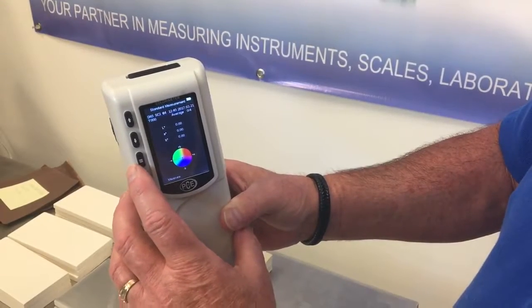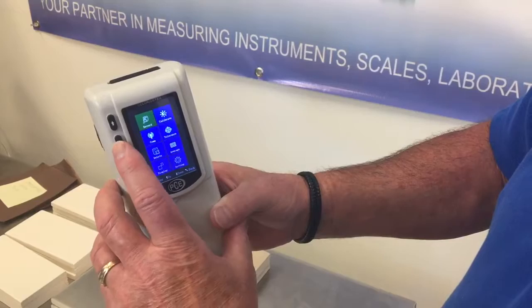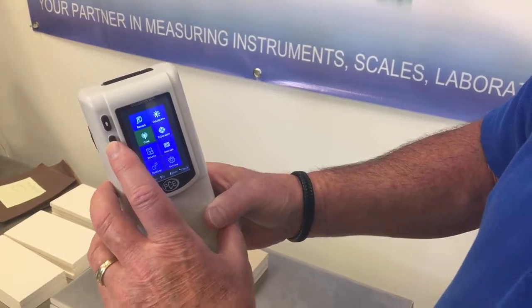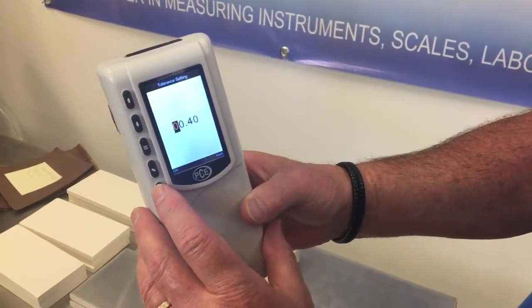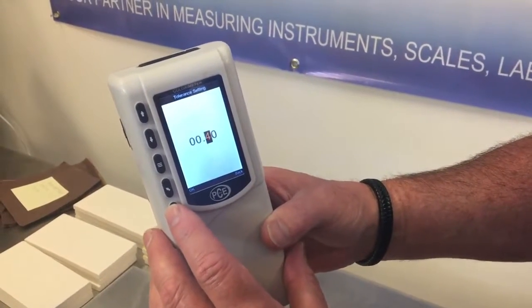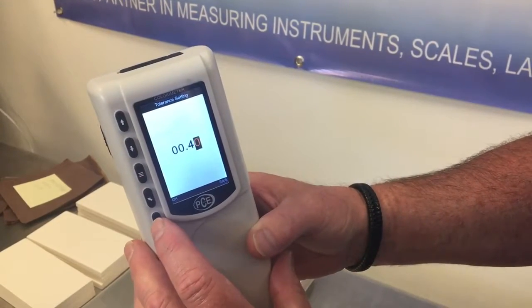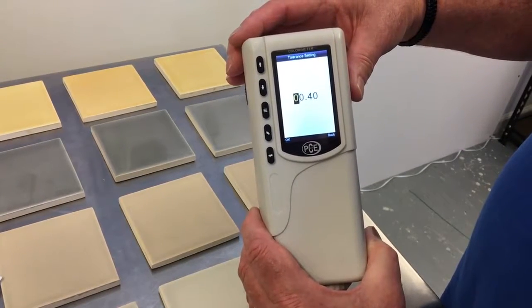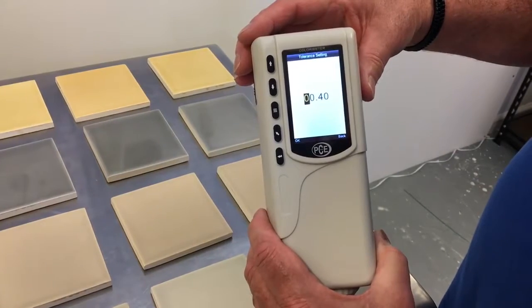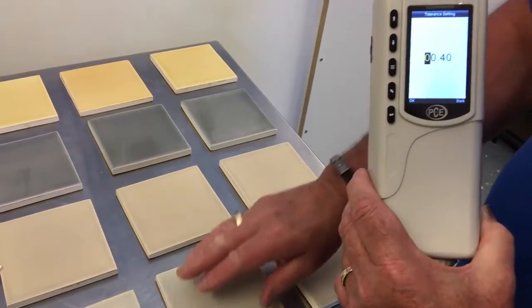Now we'll set the allowable tolerance. Go into menu, go over to tolerance. Enter. On. Zero zero point four zero — that's good, that's where we want it, so we're going to leave it right there. Exit. The tolerance value is set by the user and depends on the amount of deviation that the user wants to allow between the reference and the sample.